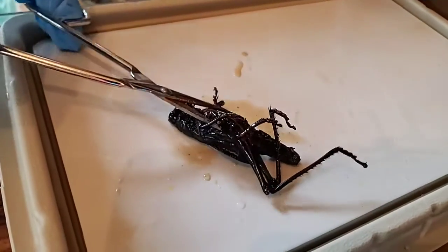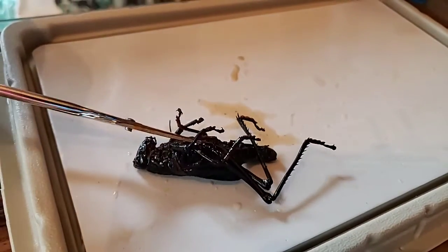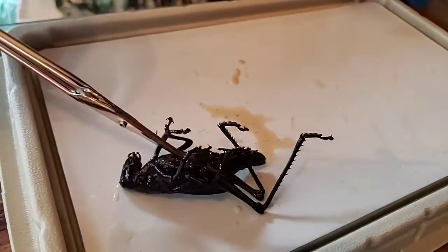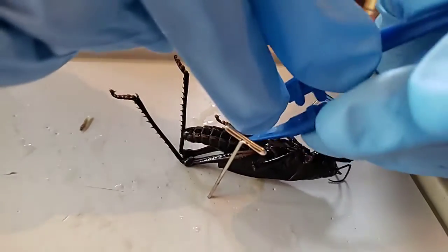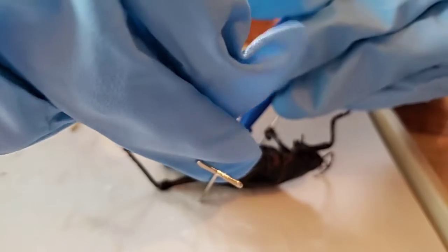You kind of just have to pull it apart. Look at that. Done. Did you get yours cut open? Okay, so how are you going to spread the grasshopper open? You just spread it open. I did it. What do you use? These two tools, for you kids at home. You use pins and needles.